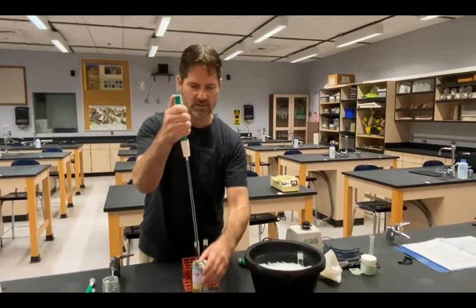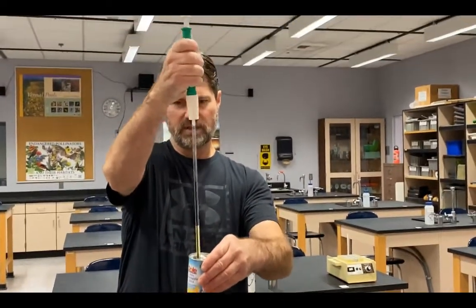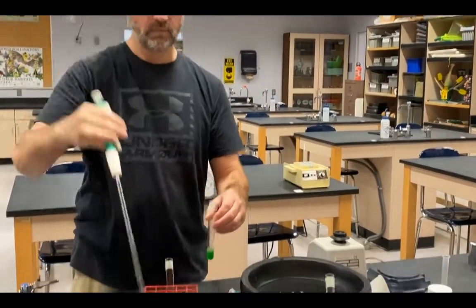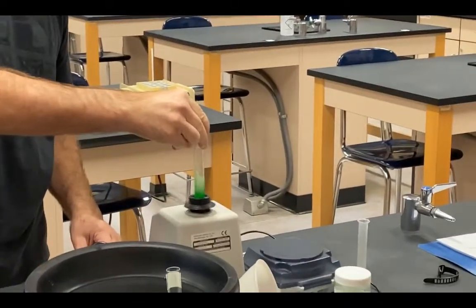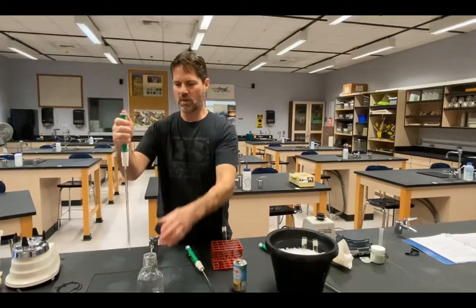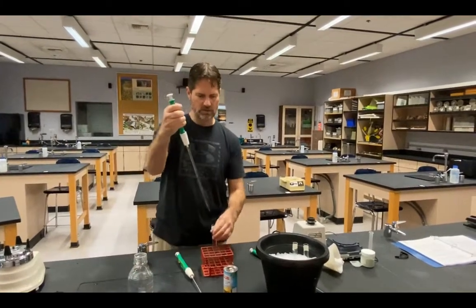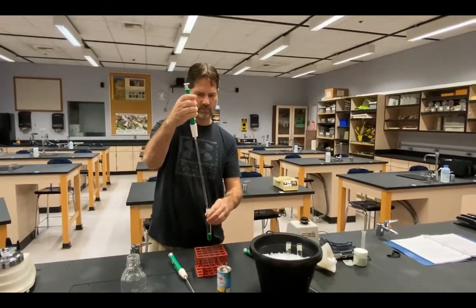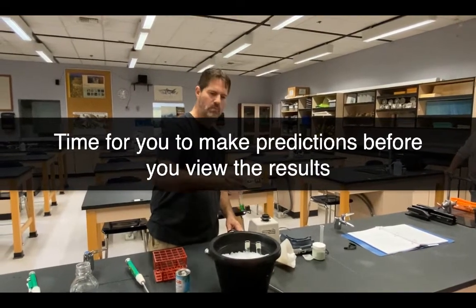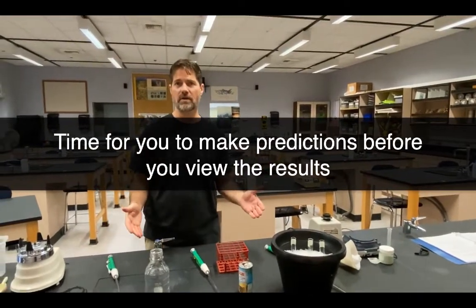I'll do the same with the canned juice — pulling up 2.5 milliliters from the can we just opened, mixing that tube, and adding it to the ice. Finally, I'll take 2.5 milliliters of water and add it to tube three, mixing before placing it on the ice as well. Now I need to allow these some time to set, then come back and observe any differences between the tubes.